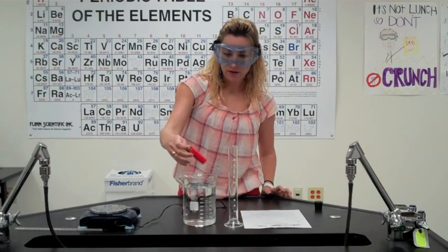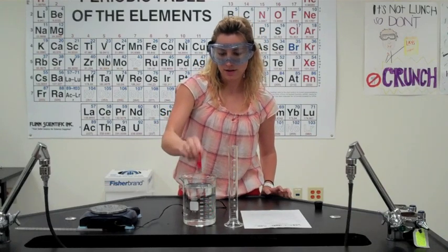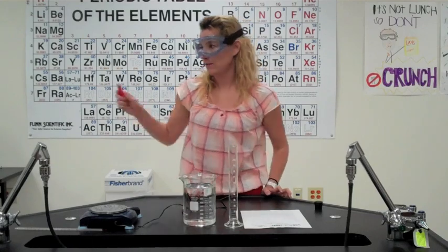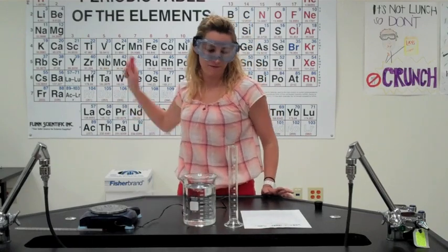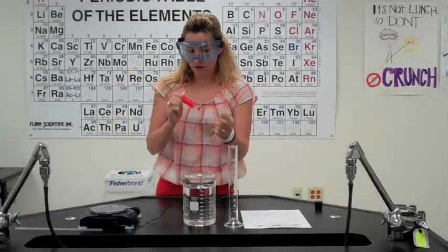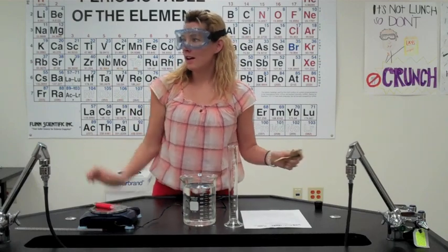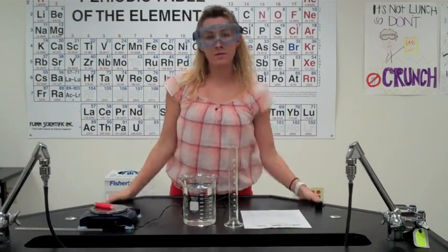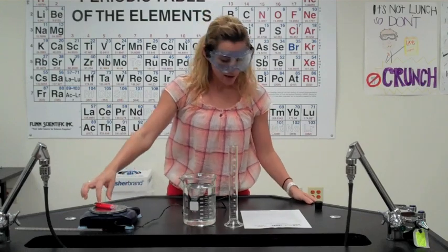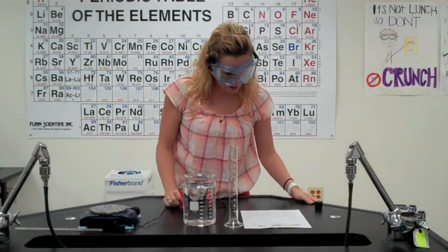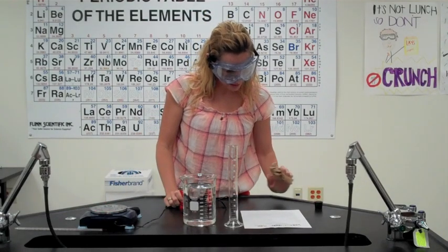Now we're going to take this out, dry it off as much as we can, and we are going to find the mass of our butane lighter. Our initial mass is going to be 21.84 grams. At this point, we are now ready to go on to the next part.